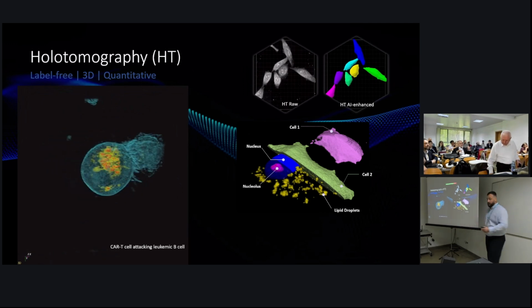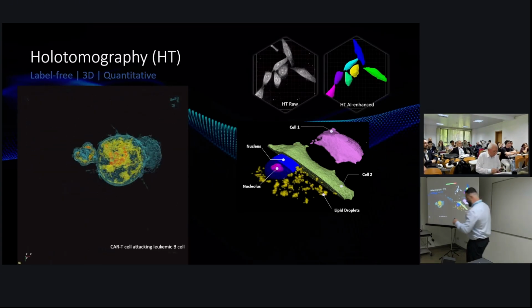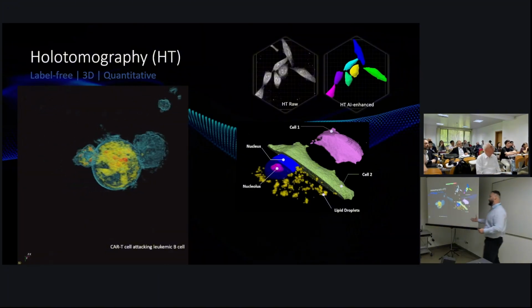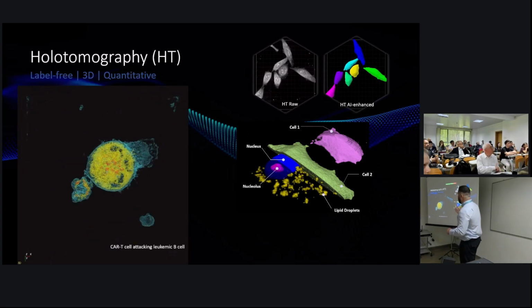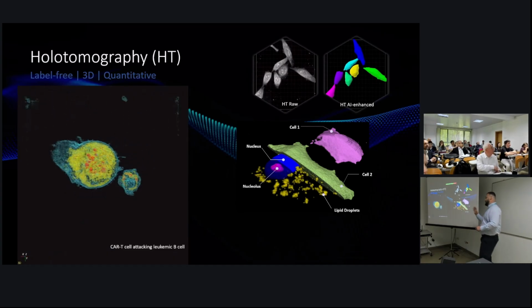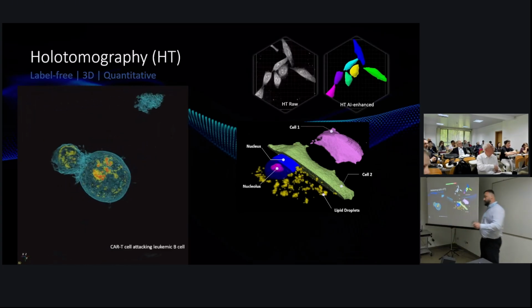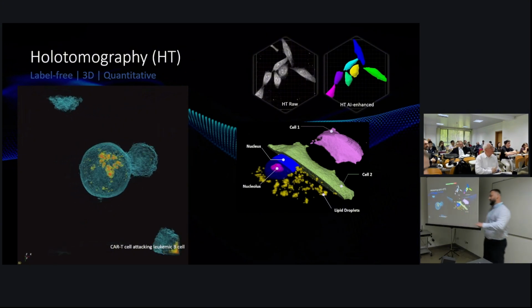So it's gray levels. We measure refractive index in 3D. Whenever you see this word, holotomography, think about 2 words, holography and tomography, the fact that it's in 3D. Normally whenever I give this presentation, my main joke, or whatever you want to call it, is whenever we talk about holotomography, I want you to remember 3 things. Holotomography is always 3D, is quantitative, but it's also label free. Those are the 3 words that I want you to remember from this talk, if nothing else.